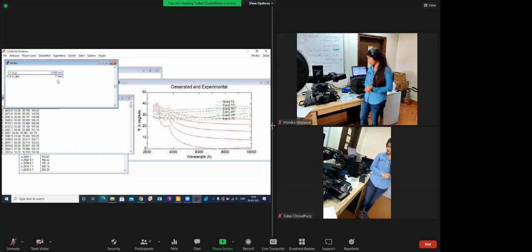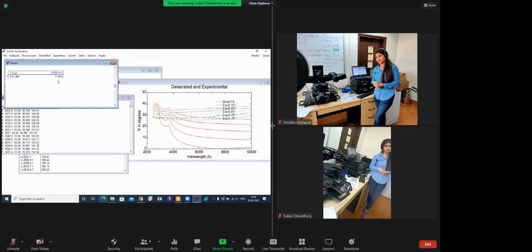There's one thing: is tungsten an inert metal? Because otherwise a small oxide layer will be there on the top. I think so, if it is kept at ambient temperature. Yes, obviously an oxide layer will be there. Definitely, an oxide layer will be there.